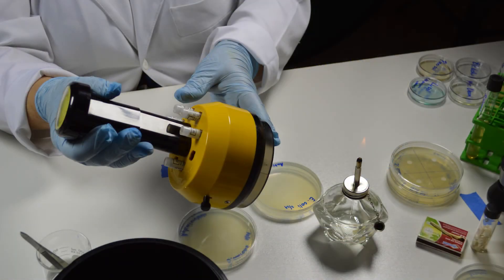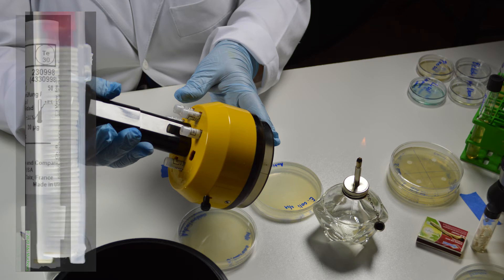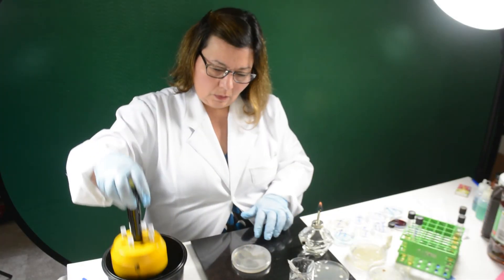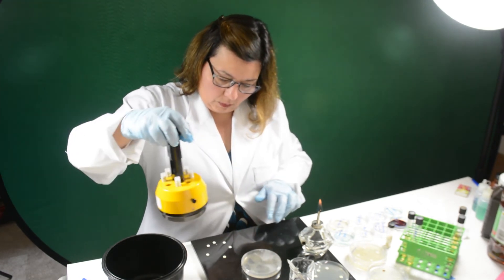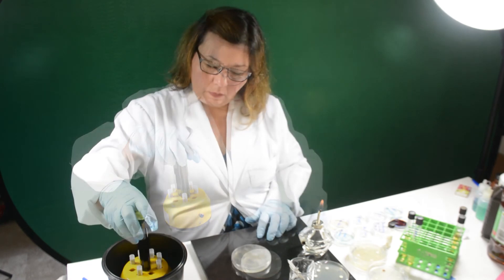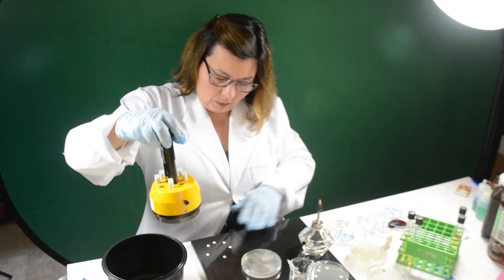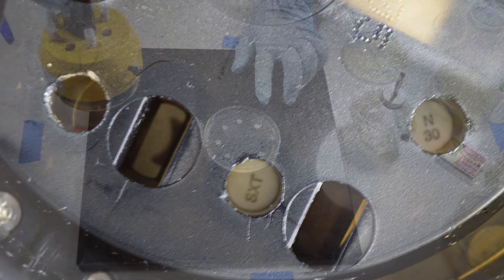This is an antimicrobial impregnated disc dispenser. You can see the stacks of discs inside individual cartridges, each labeled with the antimicrobial contained in them. This model dispenses by pressing the plunger in a motion from the top down. The plunger should travel down smoothly and make a click-clack sound — not like something is stuck or cracking. If it freezes, do not press harder; there is something wrong and it needs to be inspected.